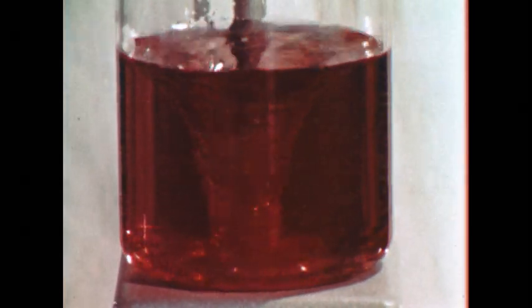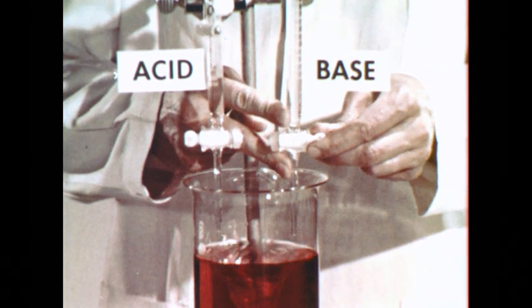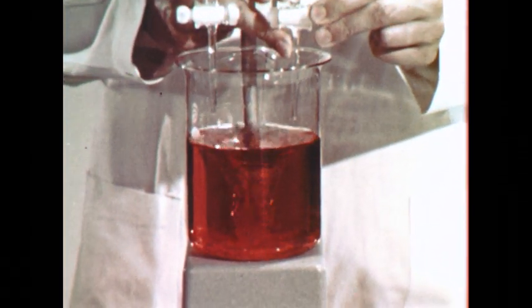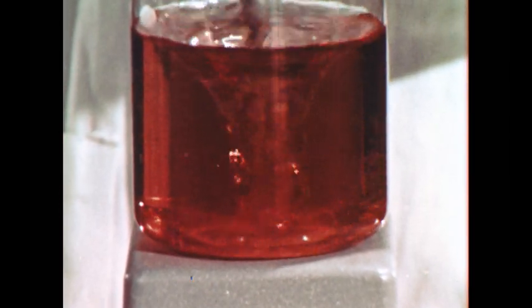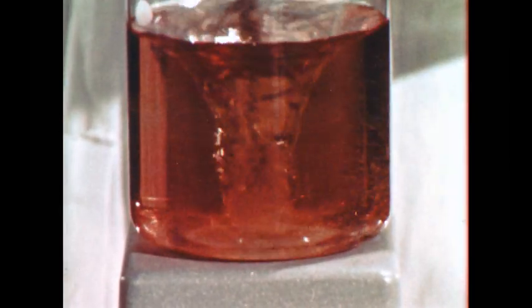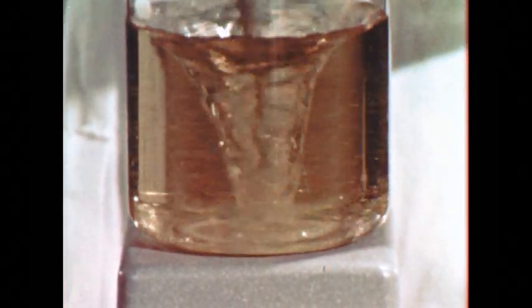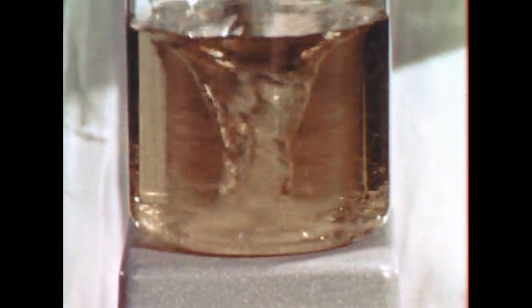Let's stop adding acid and add base to the indicator solution. The strongest acid, methyl orange, donates protons first. The solution is again orange. Next, the methyl red donates protons, leaving only yellow forms in solution.